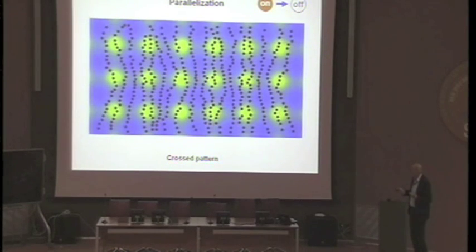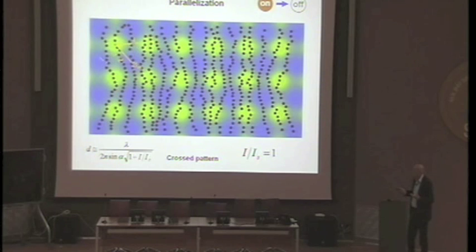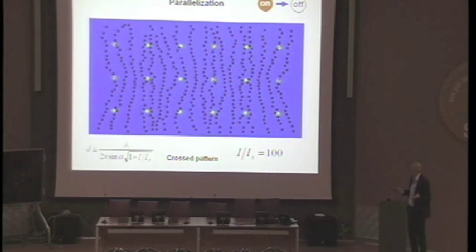And then if you think about it, then you realize that the resolution gain scales inversely with the square root. And this really helps you, in fact, most naturally, to get here a round area of on-state. Why? Because here you have twice the intensity because you cross the light like that. But the distance is by square root of 2 further away because of the triangle here, you see. And so, okay, this is just compensated. And in the end, the gist of the story is it becomes round. You don't have to turn the pattern, nothing.